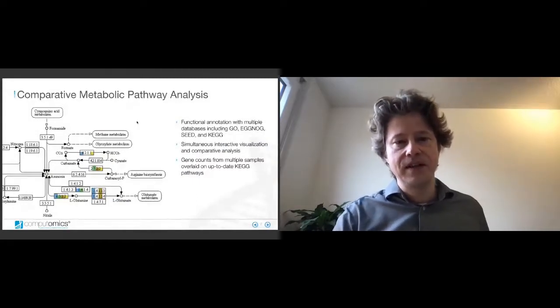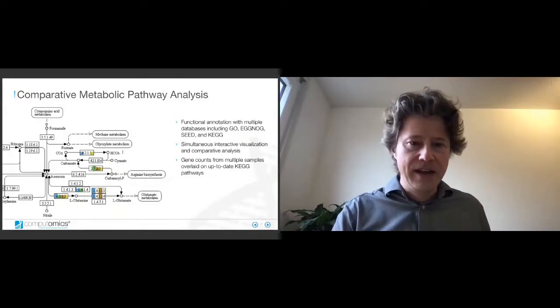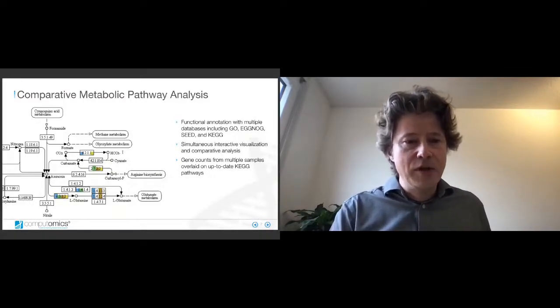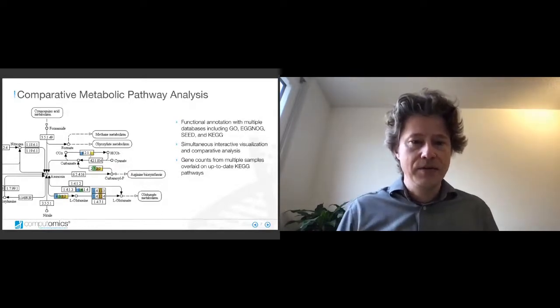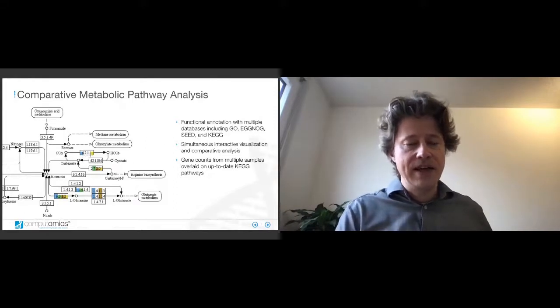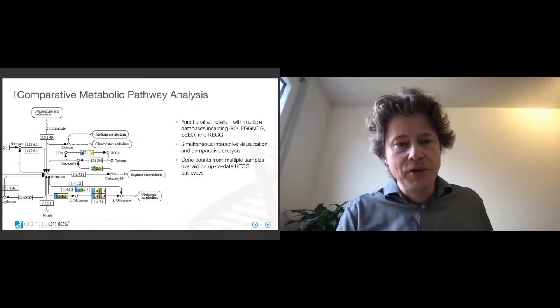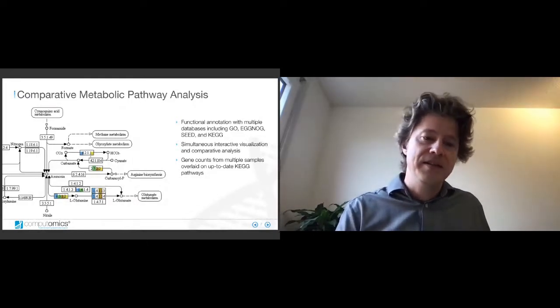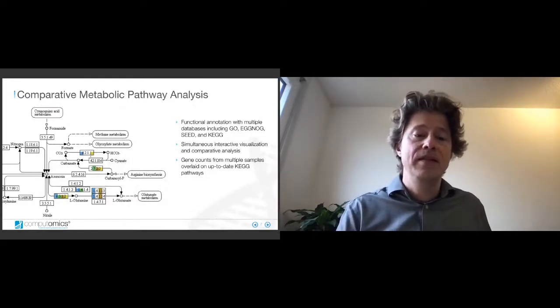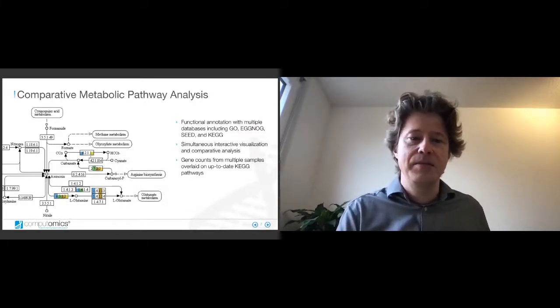So this is a biochemical pathway taken straight out of KEGG, and you can overlay the abundance of the respective enzymes onto this pathway map. And for example, here you can see that this enzyme, with this enzyme commission number 4211, is abundant in the blue and in the yellow sample, but it's not present in the other samples.